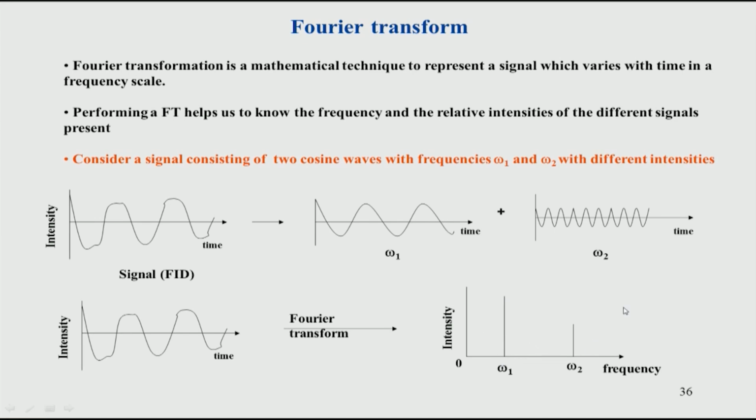This is how a spectrum is recorded. Basically, you record a time domain FID. The FID is automatically combined, because that is how the whole signal is detected, and upon Fourier transformation, which is typically done by the computer automatically, that will give you a spectrum.